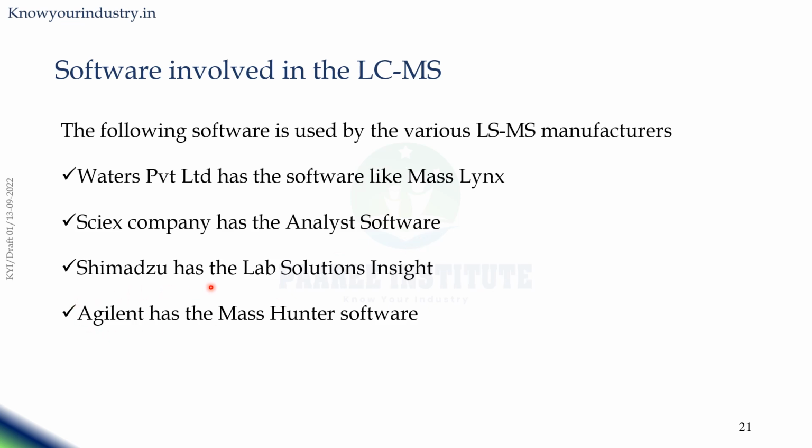Shimadzu also manufactures LCMS instruments, and it uses LabSolutions Insight software. Then Agilent, one of the manufacturers of LCMS systems, uses MassHunter software for the analysis of various molecules.